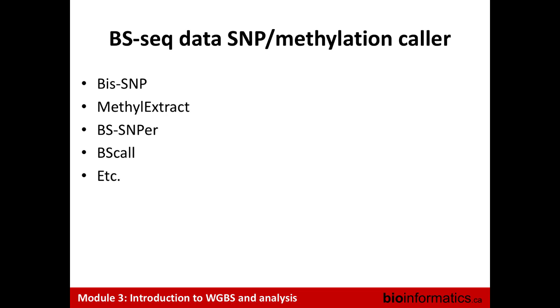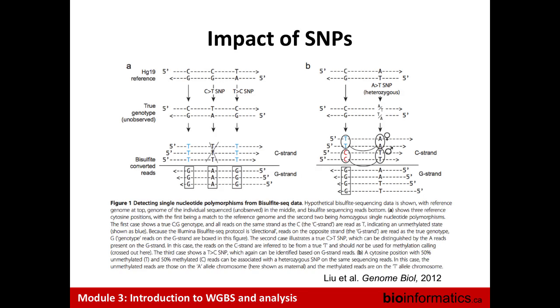My point here was really just so that you're aware of this. You can imagine that depending on the CpG density and the SNP density, these problems become even more tricky to resolve. Especially for calling SNPs like this, you do need sufficient coverage to have enough observations on both strands. Another thing I didn't even talk about is that you also sometimes have errors. You'll have a read that actually has an error, and that is in there too. So it's not so easy to call SNPs.